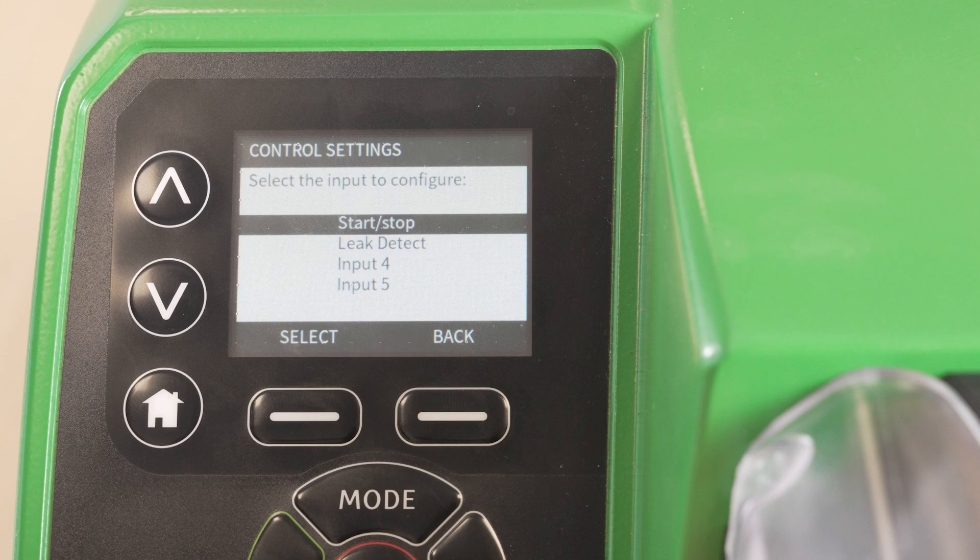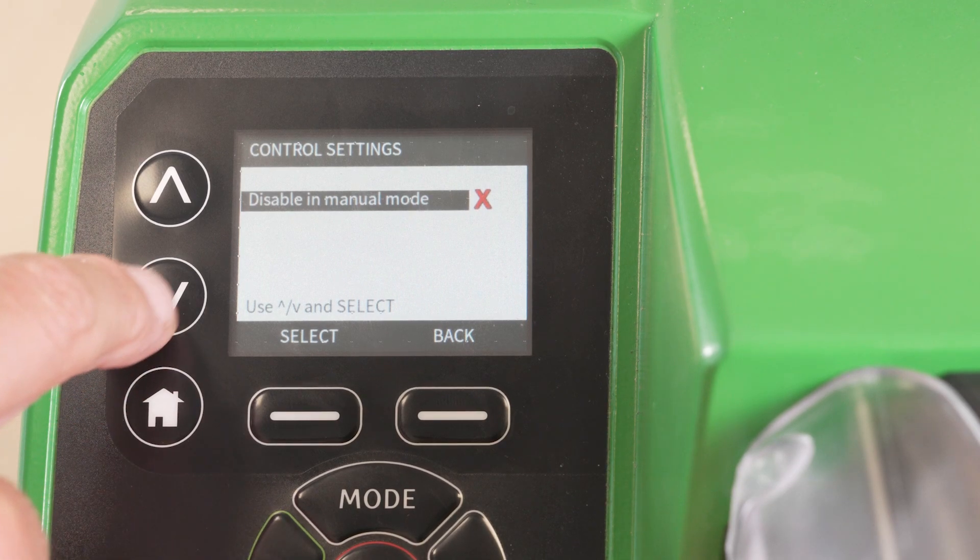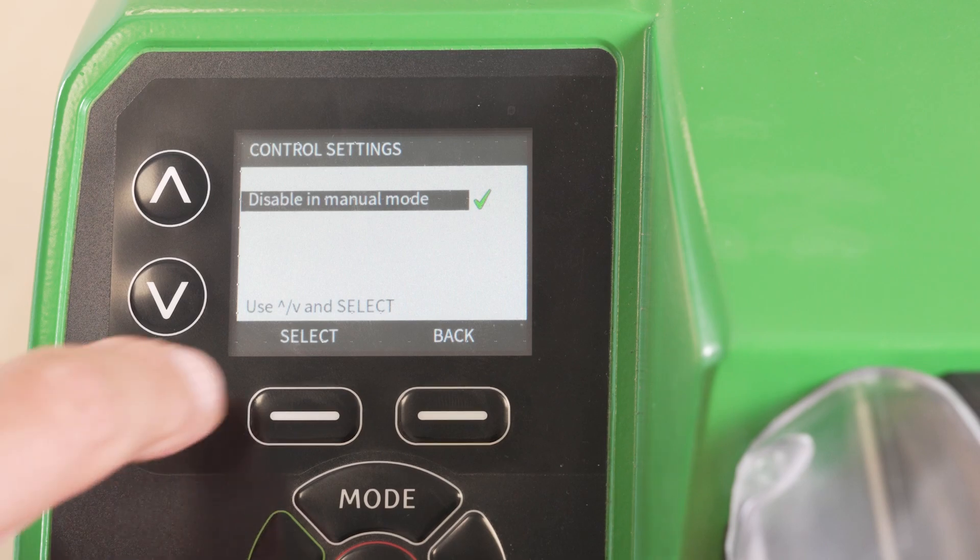This is also referred to as remote stop or run stop. Select your input. Using the arrow keys you can choose to disable input in manual mode. This can allow end users to override the control system to manually prime the pump. In this example we'll disable this option.